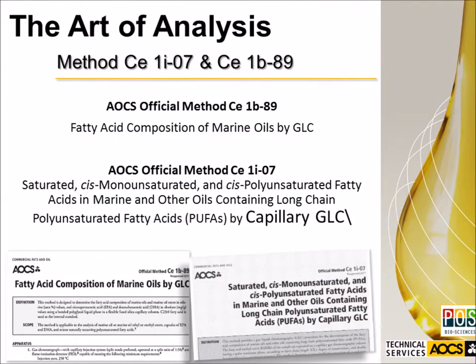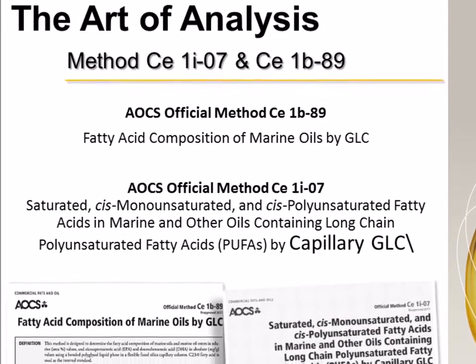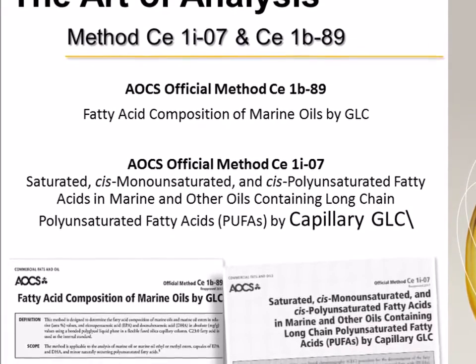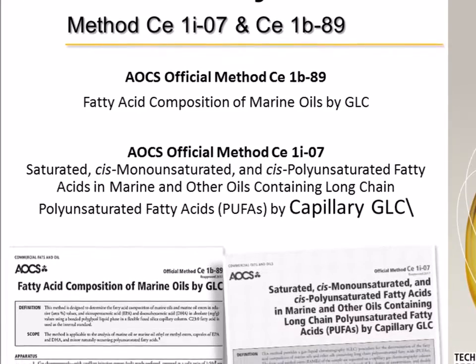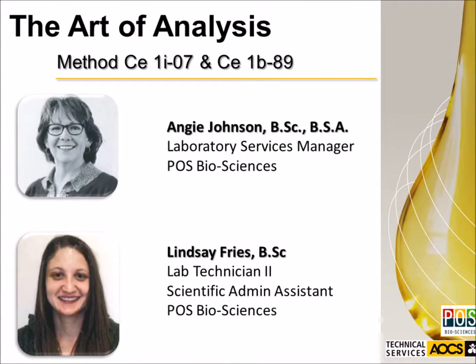Today, we will see a video from the POS Biosciences Laboratory demonstrating two methods that relate to saturated, cis-monounsaturated, and cis-polyunsaturated fatty acids in marine and other oils, and fatty acid composition of marine oils by GLC. After the video, there will be a live Q&A session with the experts running these methods.